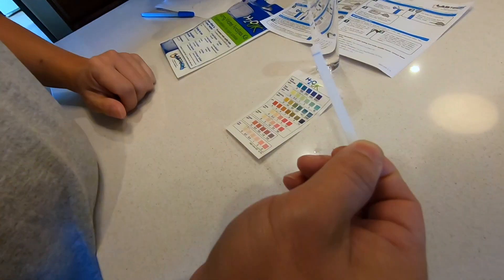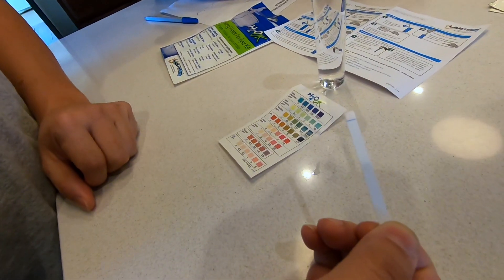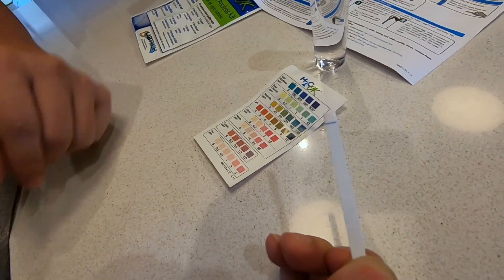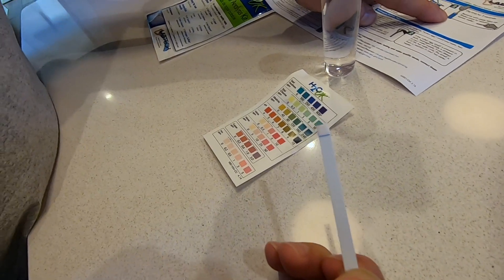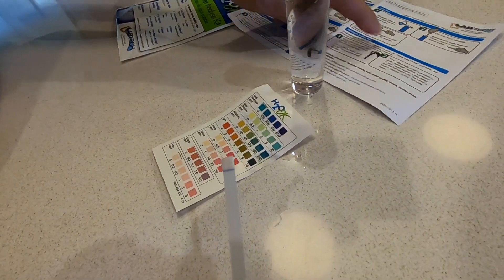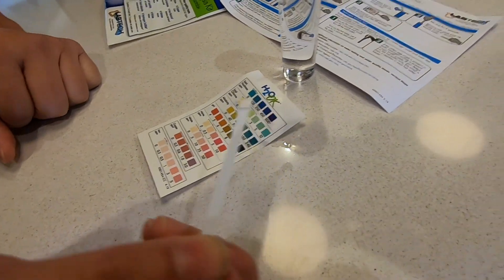We are going to do the iron test next. I already removed the pad from the iron test packet. The instruction says dip for two seconds, remove face up, shake once, and then we have to wait 60 seconds.